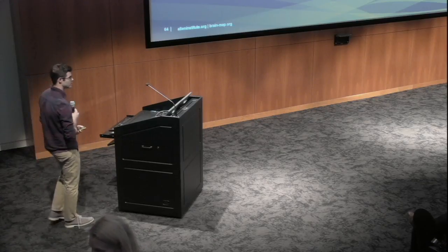All right, thanks, Alice. So I'm going to be talking about some of the work we've been doing on the multi-patch electrophysiology pipeline, looking at synaptic connectivity in both human and mouse brains. So I'd like to start by walking you through an example of what a multi-patch experiment might look like.